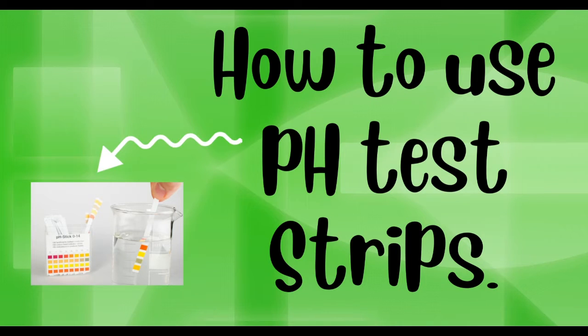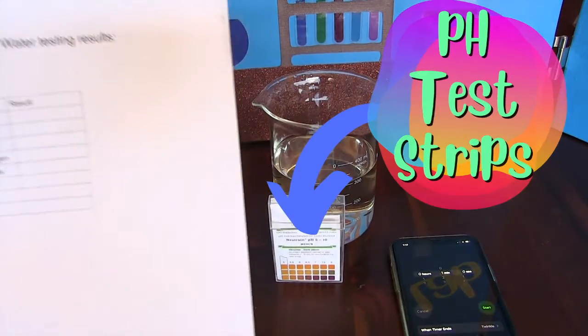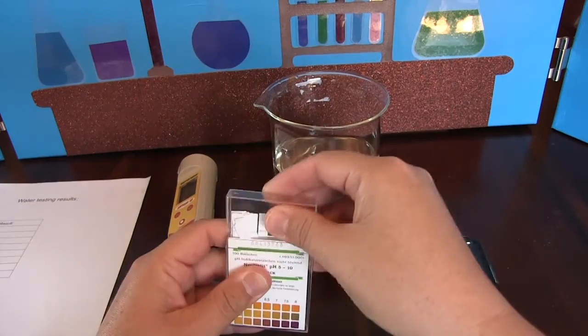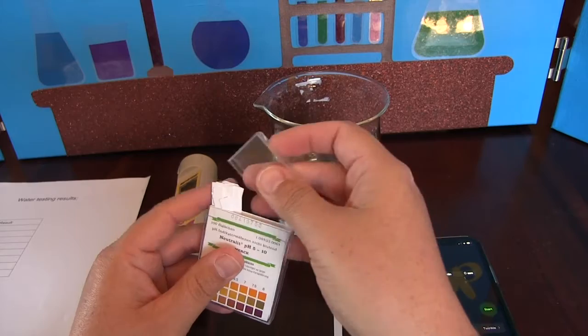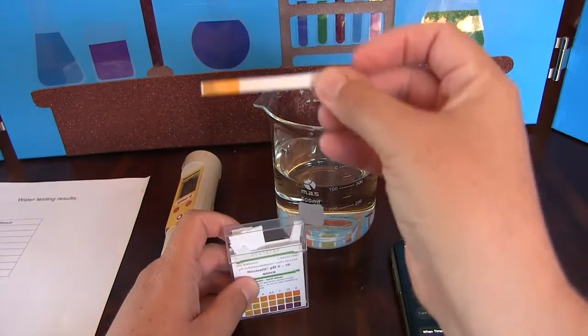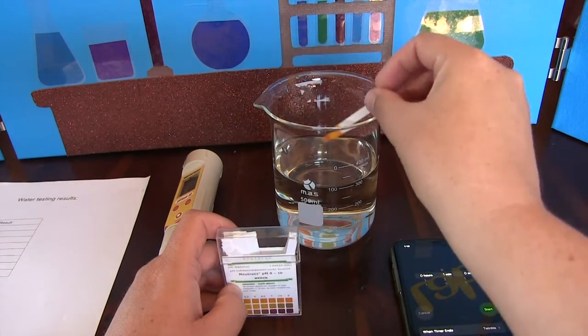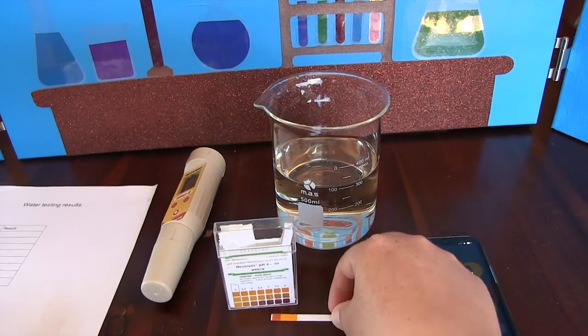First, we'll go through how to use our pH test strips. We will need a water sample, a timer, test strips, and a table to record our results. To test the pH, we take one of our test strips out. We then dip it in our water sample for a couple of seconds. After we've placed it in our water sample for a few seconds, we are then going to leave it sit for 60 seconds.